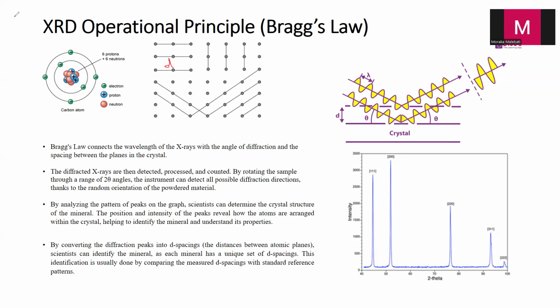And then, good people, what happens is when the X-ray beams hit the atom, the electrons become energized. They absorb this X-ray energy, but they end up not using this energy, and they re-emit the X-ray. Basically, that's how the atom behaves.